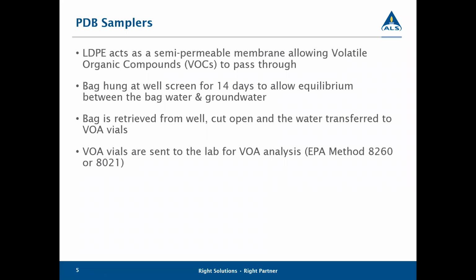And that's definitely one of the strengths here, for long-term monitoring situations where you might be going out on site, call it quarterly or semi-annually, even annually. You can go out, you can deploy your passive diffusion bag, come back the following quarter, it'll be in equilibrium, retrieve it, collect your sample, and go ahead and deploy the next one for the following quarter.